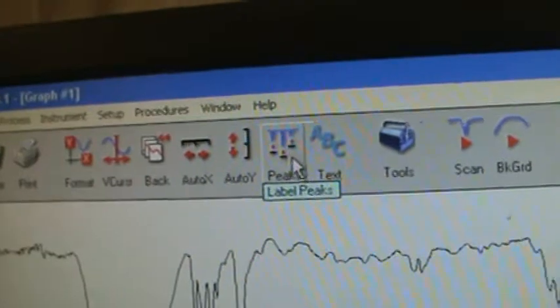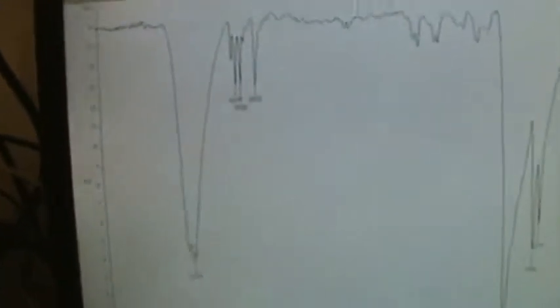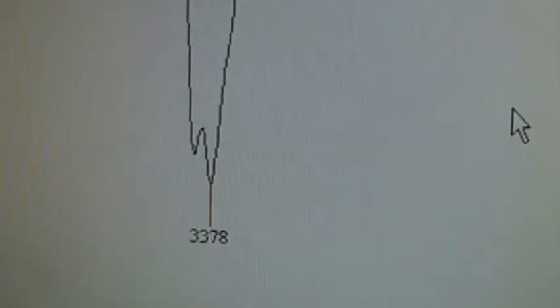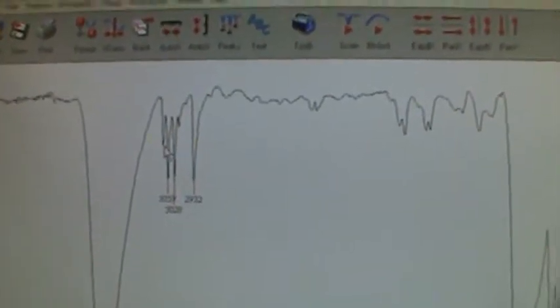So you can see this button. This basically says, click on this, and you're gonna magically pick peaks. Yay! I just picked up right here something that I don't like. See how there's clearly two? I'd like to pick this. And I'm looking up here, most of these ones are good. Maybe I want that one, maybe I want these two, but a lot of them are picked.